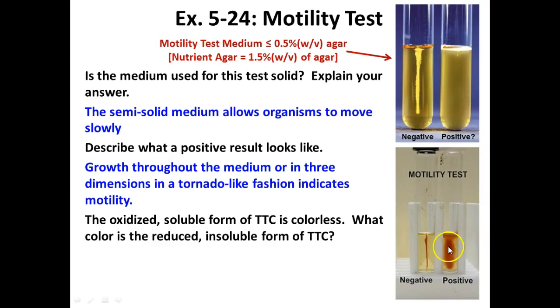Color. Red, right? And again, that really helps us visualize the motility and see where the growth is in the tube.